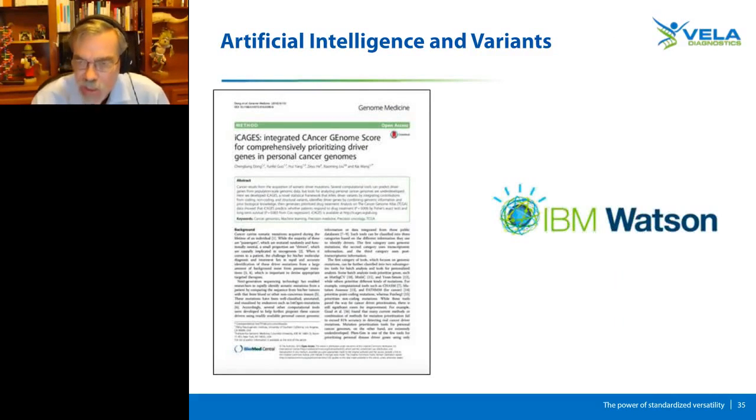Lots of things are changing in the sequencing world, and variant calling is no different. There is a lot of new information about mutated genes, pathways, variants, and the drugs to treat them with. There's also valuable information with regards to dosing, routes of administration, and outcome. No one can be expected to know or to recall all of this information. There is the promise of artificial intelligence, AI, and machine learning coming along to help make sure that the variant calls and the drugs assigned are the best possible choices for each patient.